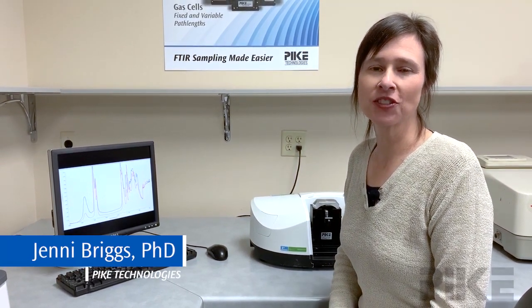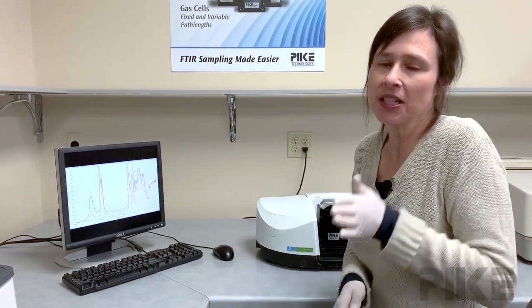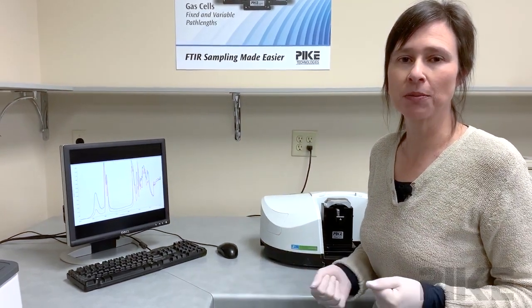Welcome, thanks for joining us. Today we're going to talk about diffuse reflection measurements for powders. Typically your sample will be diluted with KBR for mid-infrared analysis. That dilution — I typically start with one percent and increase it or decrease it depending on what my spectrum looks like.